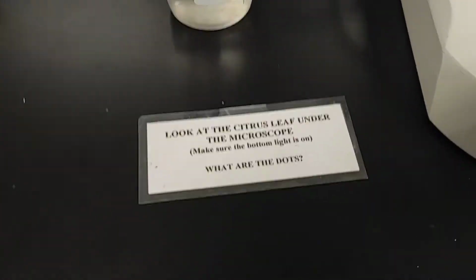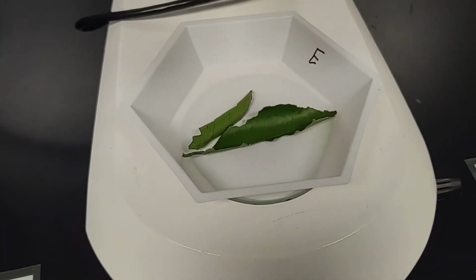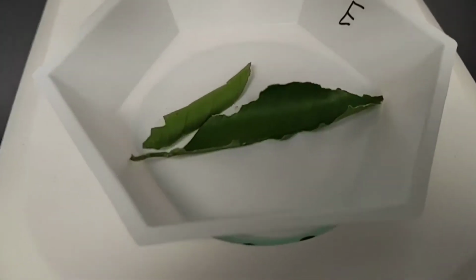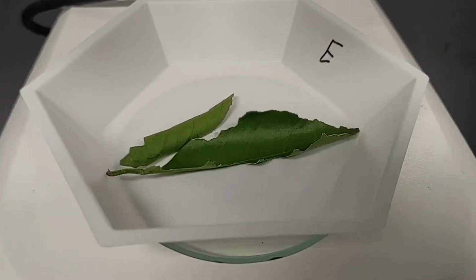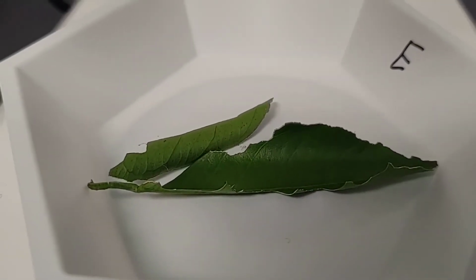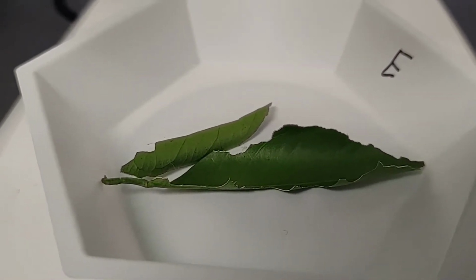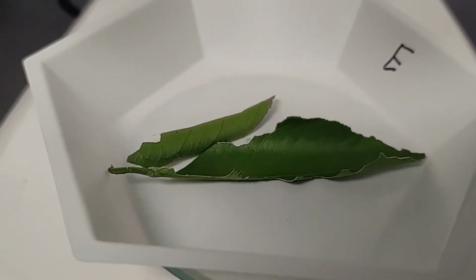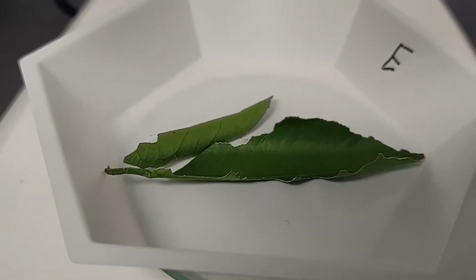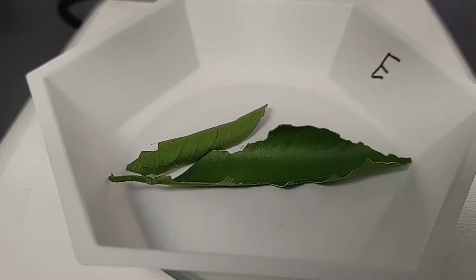And here, if you were to look under this dissecting scope and look very closely at these leaves, you can actually see them with my camera. So do you see the furthest away leaf has these dark dots? These are pellucid dots, and they are the repositories for the citrus oil that comes out of the rind.